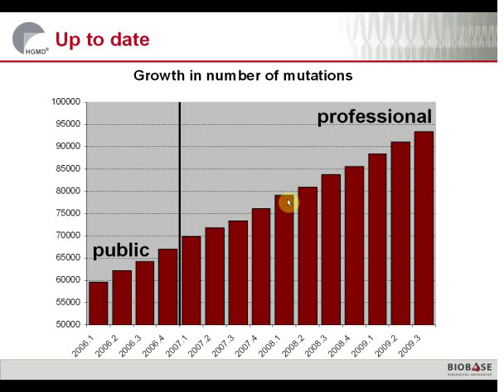As you can see, there are nearly 100,000 unique different mutations in the HGMD database, which cover over 3,500 genes and are extracted from nearly 30,000 literature articles. The black line here on the left-hand side shows where the data entries in the public version stop. All the data to the right of this black line is only available through the professional version.